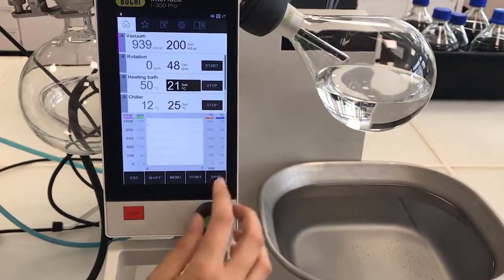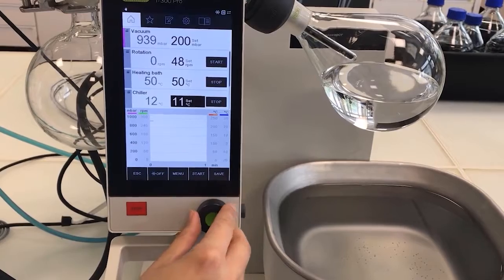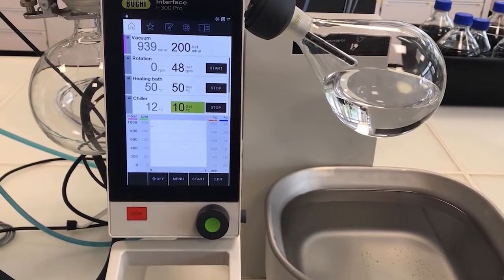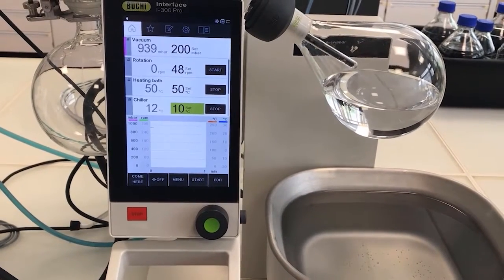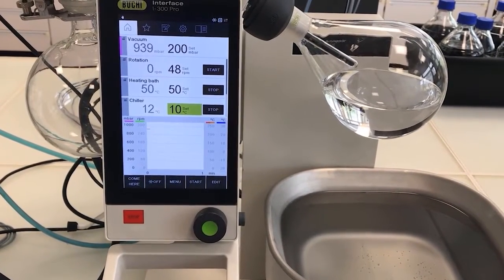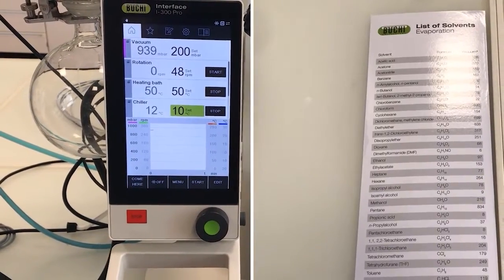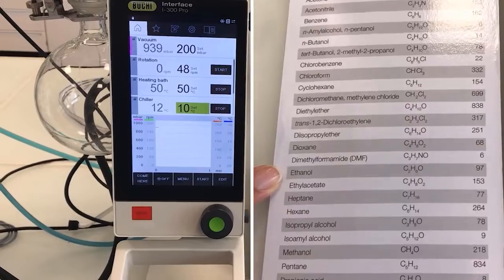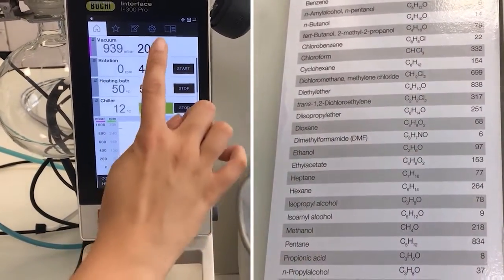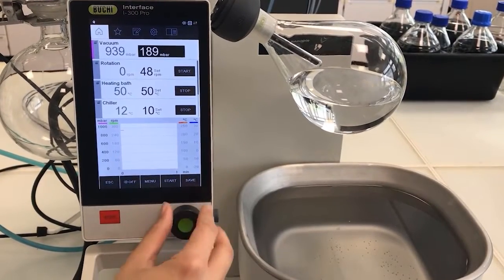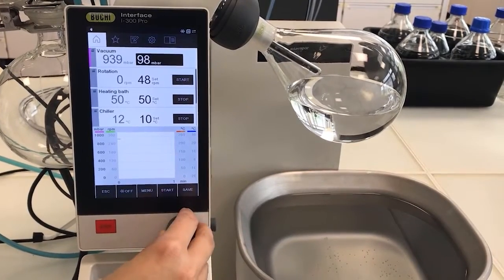We will set the heating temperature to 50 degrees and the cooling temperature to 10 degrees. Next comes the pressure. Since we target a vapor temperature of around 30 degrees, we look up the pressure values for ethanol at that particular boiling point in the solvent table. As you can see, the desired pressure should be at 97 millibars, so we go back to the interface and set the pressure to 97 millibars.